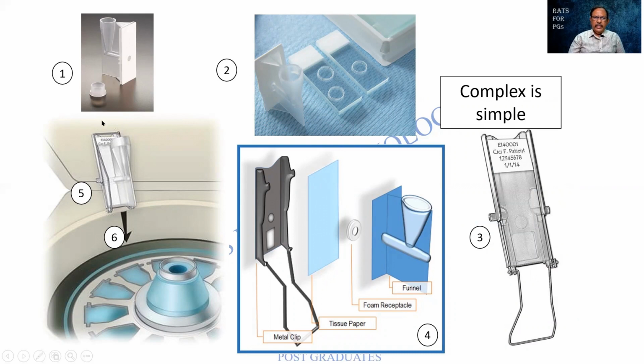So here there is a funnel. As I had mentioned earlier, there can be a lid for it. Once the centrifuge is on, nothing will be splashed. And this is the slide that will be marked. In this ring itself, you find that the cells will get deposited. Unwanted material will be absorbed by means of the filter paper, and this is a holder for it.